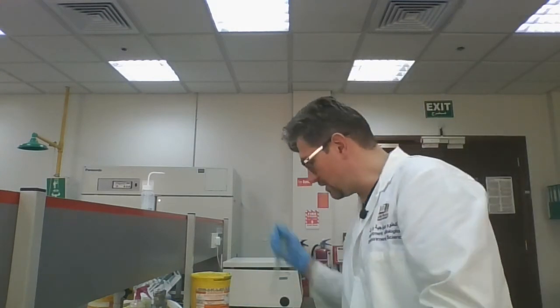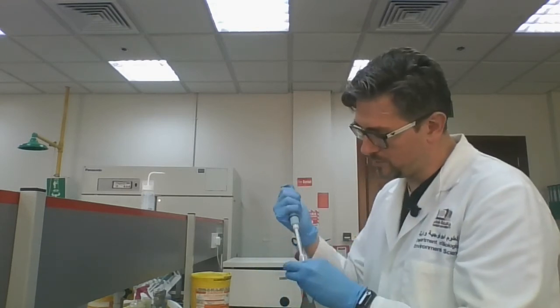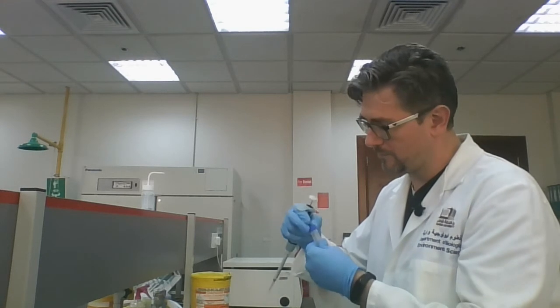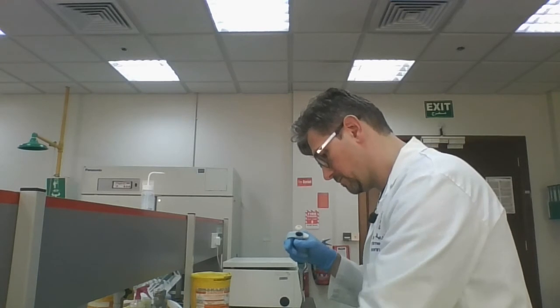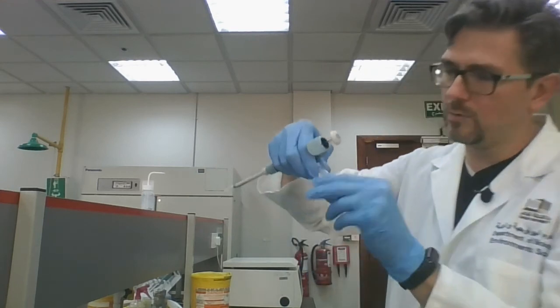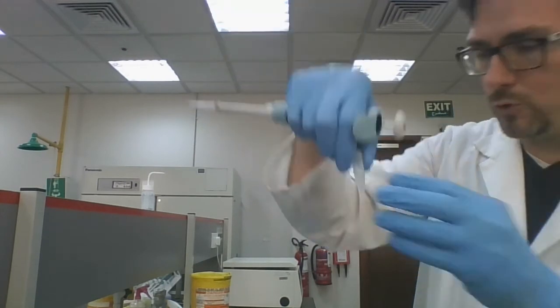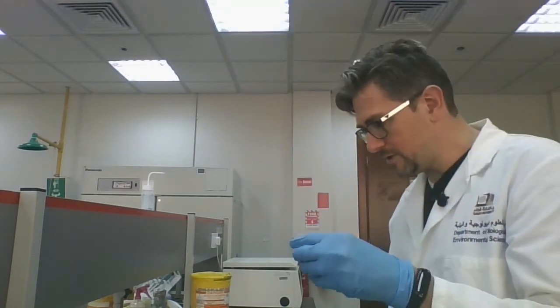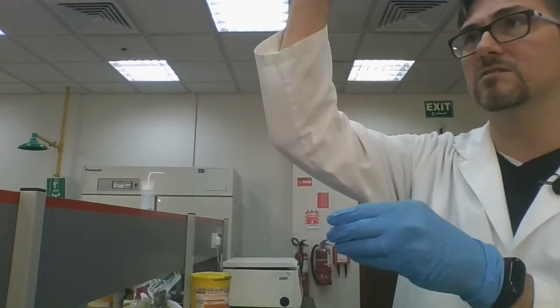I'm going to add the solution to the next tube as well. So again, solution C goes into both tubes. And again, you can see right away, as soon as you add it, you're going to see precipitate showing up. You're going to be seeing a lot of white stuff showing up in your tubes. Okay, so after doing this, you're going to mix it up, so make sure that all of that genomic DNA has come into contact with this neutralized solution. It doesn't need to be a lot, just a little bit is enough.